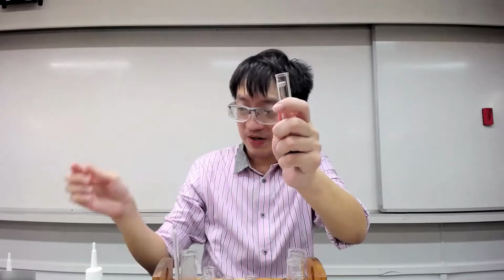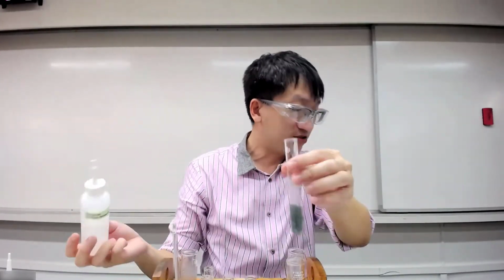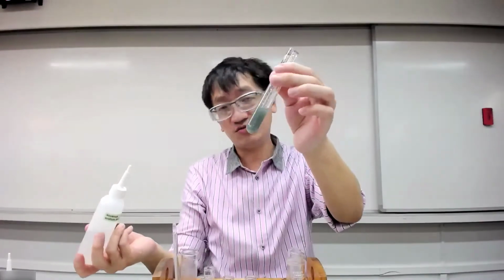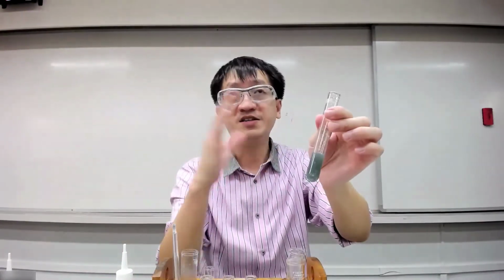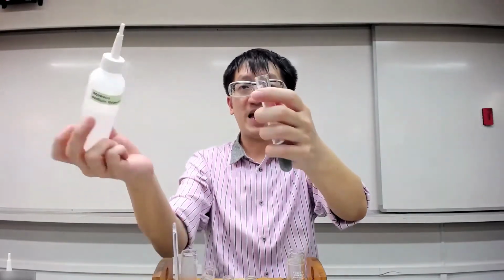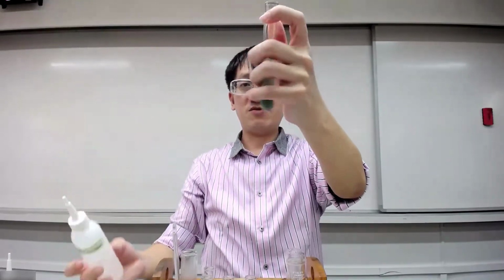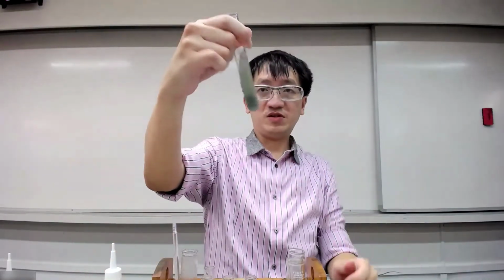But because the question asks you to add sodium hydroxide dropwise until no further change, in your observation you can write a mixture of white and dirty green precipitate observed, but when you add excess, actually only the dirty green precipitate remains, as seen from here.